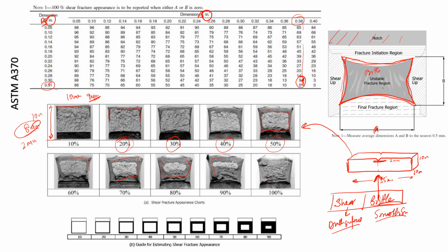And in the last portion there is no brittle region. There are some small things, but that can be ignored. So that's what is also shown over here. When it looks completely like brittle fracture, we can say around 10%, because the other things are very difficult to measure. Then 20%, some more thickness, and more and more.